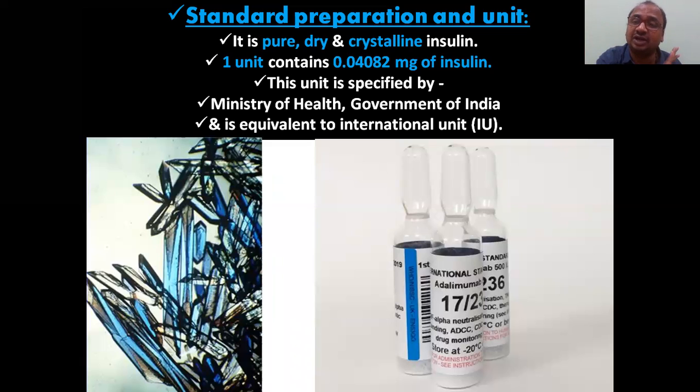You need not prepare it in your laboratory. Standard preparations you always have to purchase from international bodies or national bodies, which maintain the international standard. You can just apply to them and get the international standard. Don't prepare the standard preparation in your laboratory. What you have prepared in your laboratory is a test preparation only.